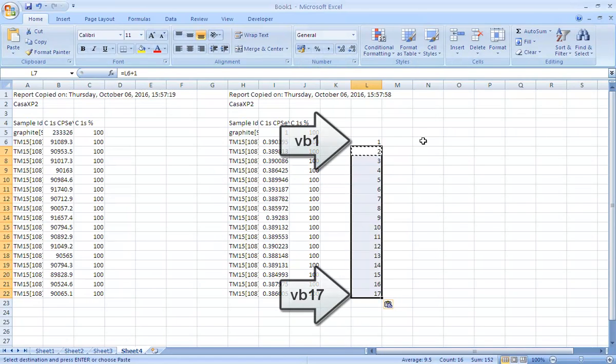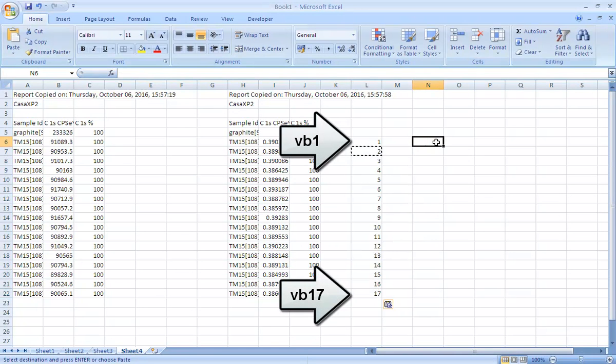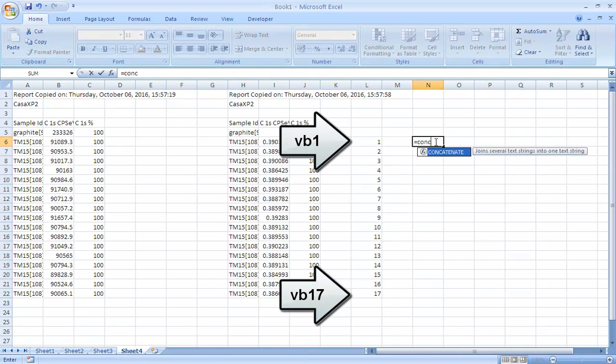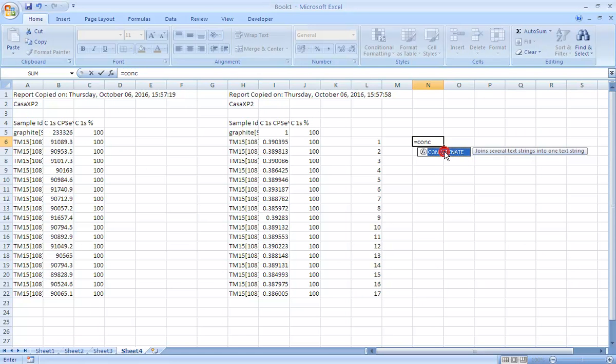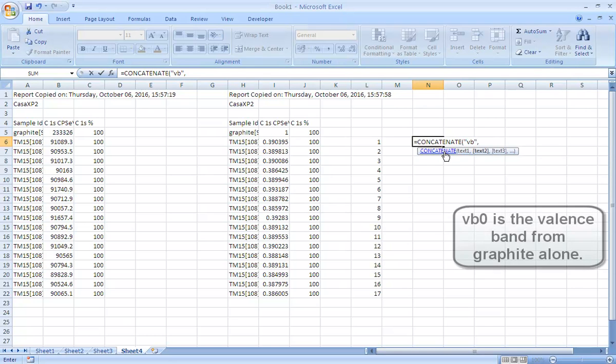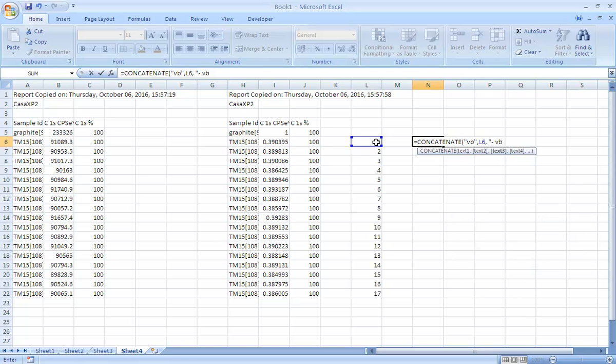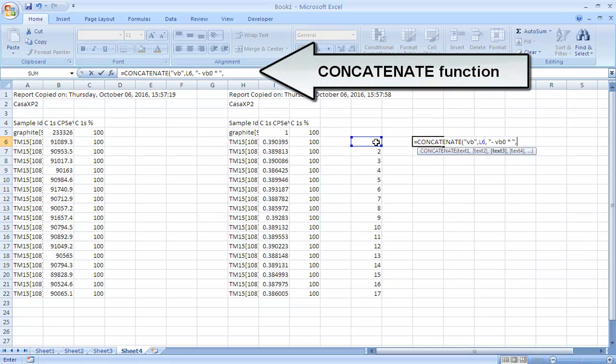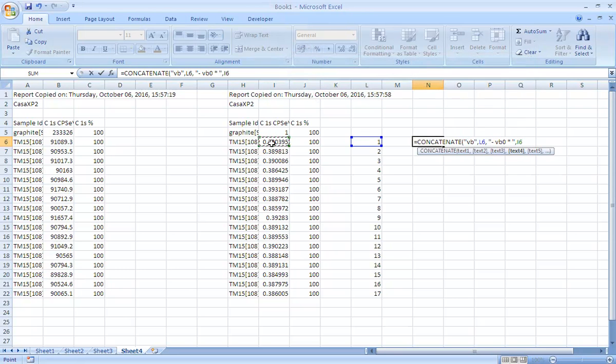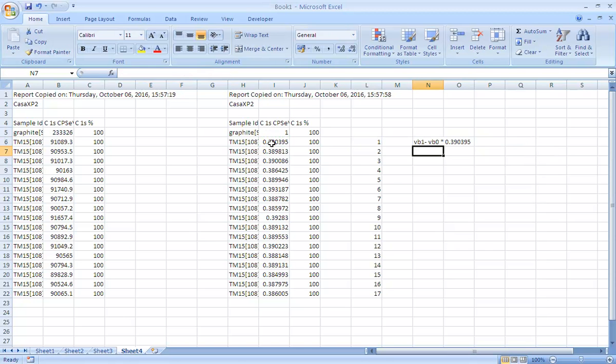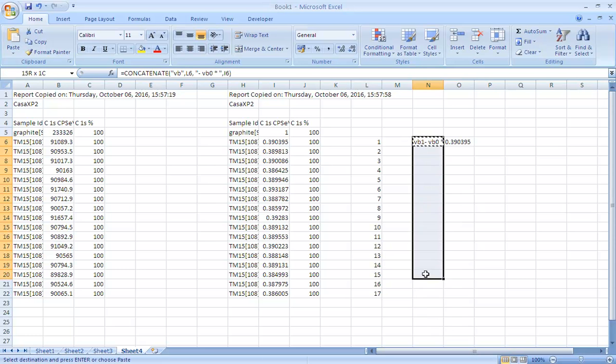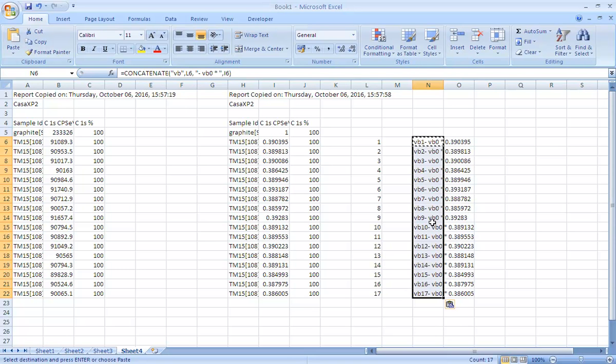Now what we need to do is subtract from each one of these Vb1, for example, the right proportion of Vb0, which is a graphitic valence band. We'll concatenate Vb with the index and then we will also have a string that says minus Vb0 times the amount that we've calculated. We've got ourselves a formula which tells us how to calculate the copper valence band in the absence of graphite.